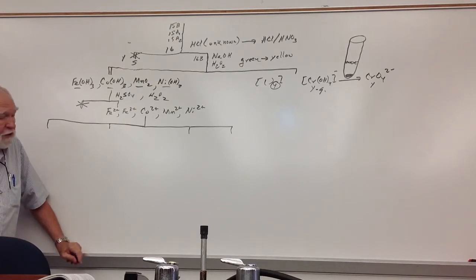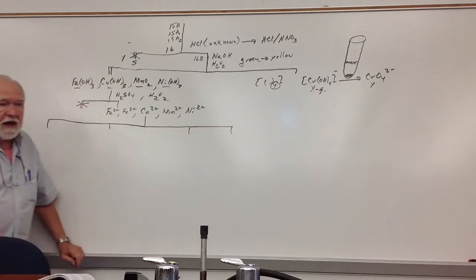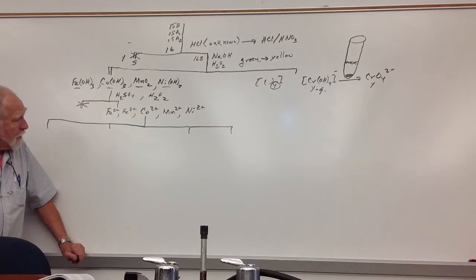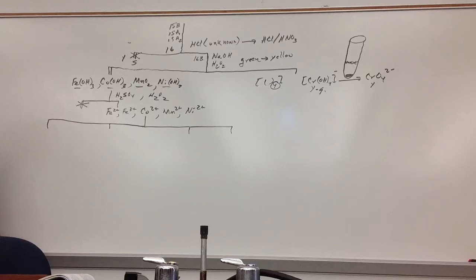So you don't want to put that much extra nickel in. And for the manganese, what you can do is prepare a known and run it alongside your unknown test. And again, you'll use 1/4 as much. But you don't have to prepare a known for me because it's going to change color just like the permanganate did when you were doing your kinetics experiment.